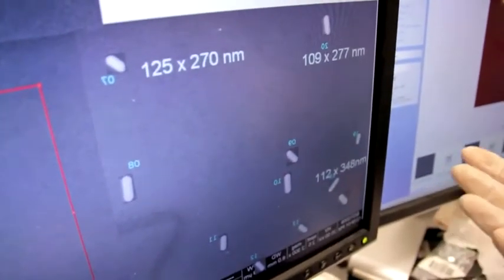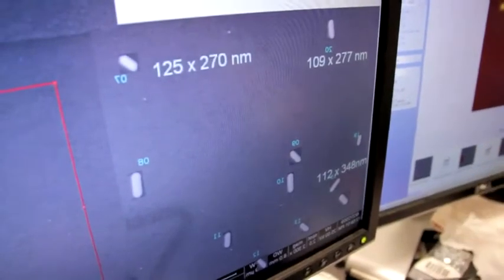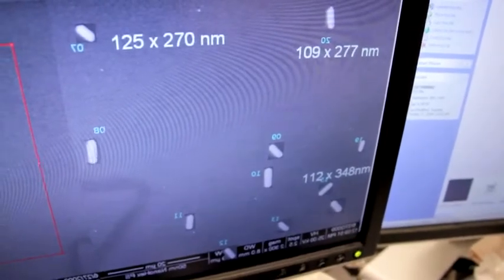This scanning electron microscope image shows a few of the nanorods, and you can see that there's quite some variation in their size, as well as some slight variations in the shape.